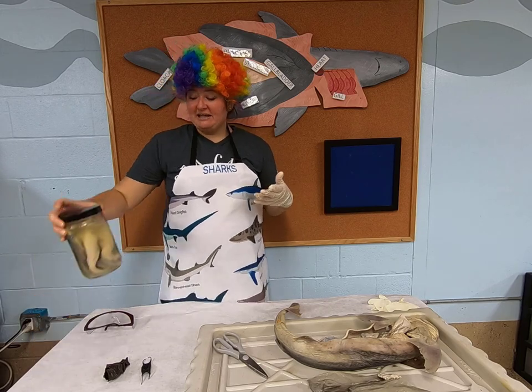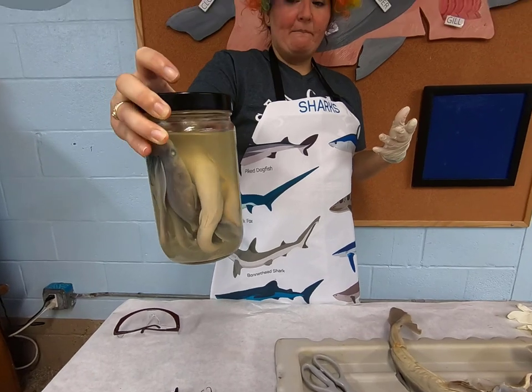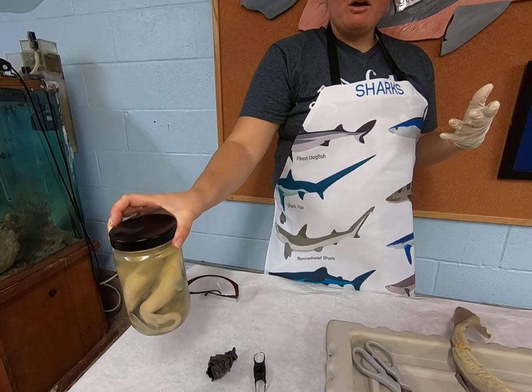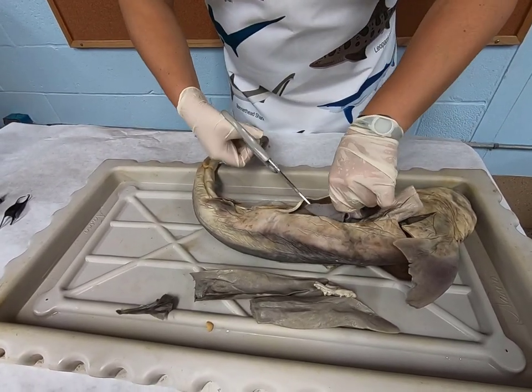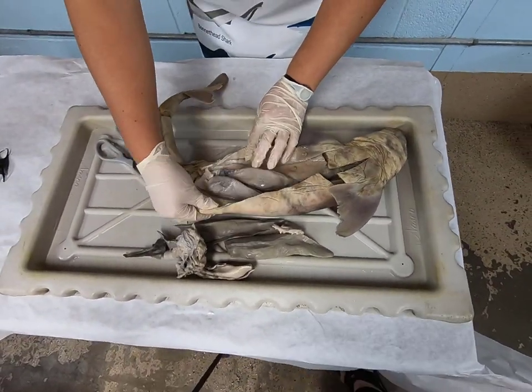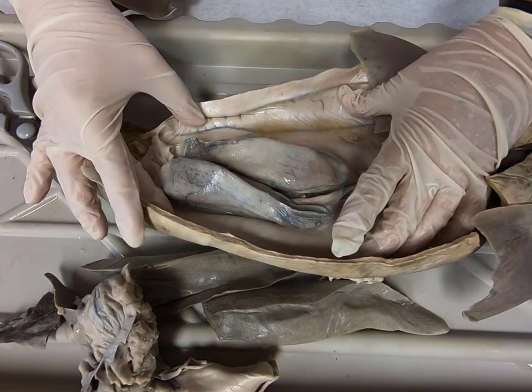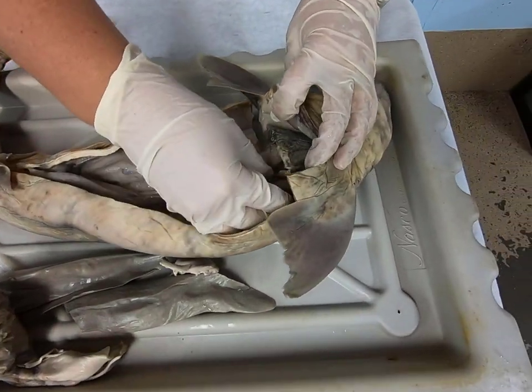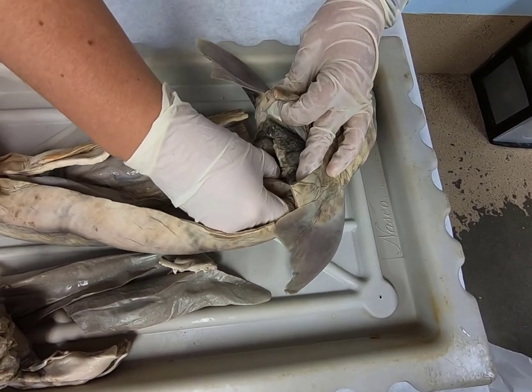Now here are some examples of babies that were almost formed and ready to be birthed that we have had in a shark dissection before. And let's see if our shark has any babies. So let's get all of our body parts out of the way. When we do this, we actually expose the uteruses. So these sharks can have four. So we have one on each side, and then we actually have two up here. Now, these two have eggs, undeveloped eggs right now.